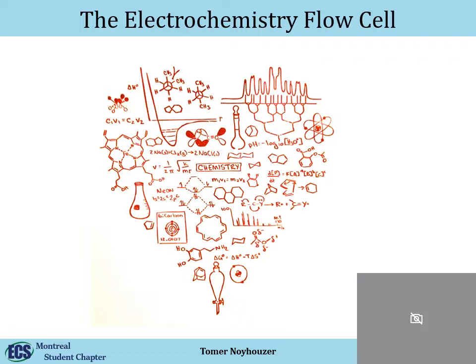And your FIA or SIA, it might be something that is already determined by the pump that you have, or it's something that is not a big deal. You already decided what you're going to use and you're going to run with it, right? And so is mixing strategy. But the flow cell, that depends on the type of measurement you want to do. And some flow cells are much better for a specific type of measurement and some are not.